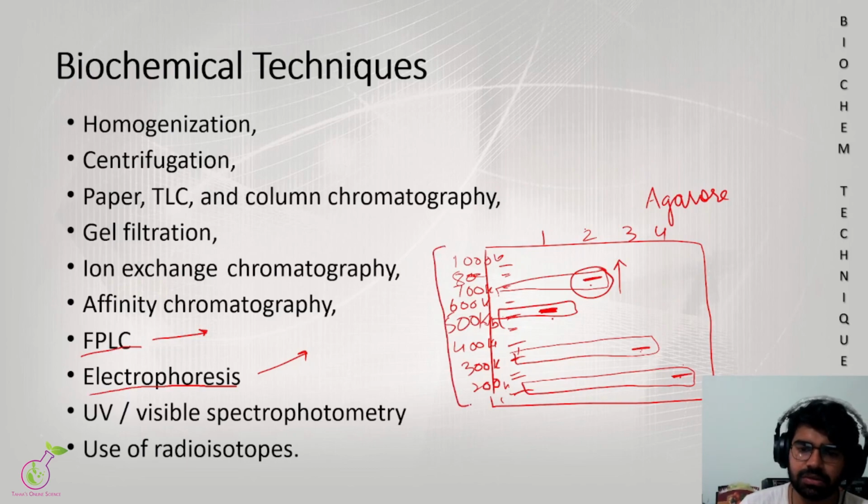Although the gel is not so big, you can just say it is around. I mean, we can get the idea of how much the size of the DNA actually is, and also the detection of the DNA. We will study this in our subsequent lectures in detail actually.